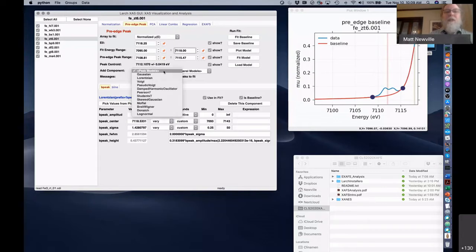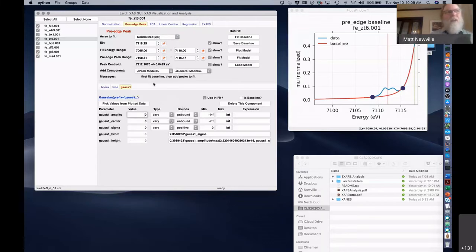So this is just simple line shapes. There's not much physics in this, except for the point that these transitions are sharp and so known to give good line spectra, using molecular orbital theory. It's not wrong, it's just not highly theoretically complex. We're going to fit Gaussians to these peaks that we know are peaks.